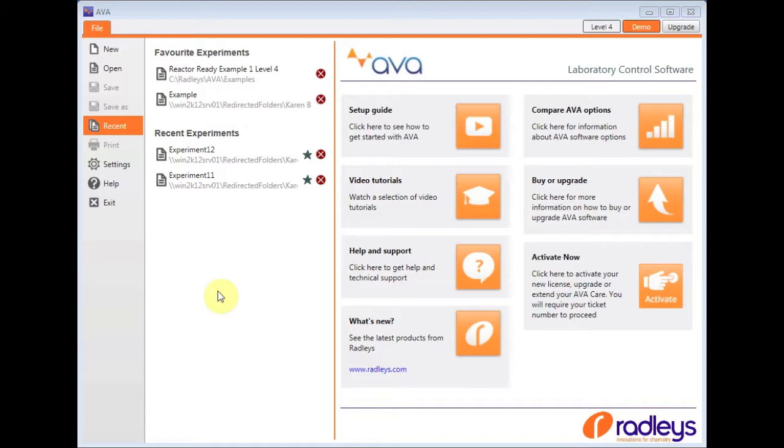AVA software can control and log apparatus in your laboratory. As you can see, I've already opened the AVA software. This is the window you see every time you open it.